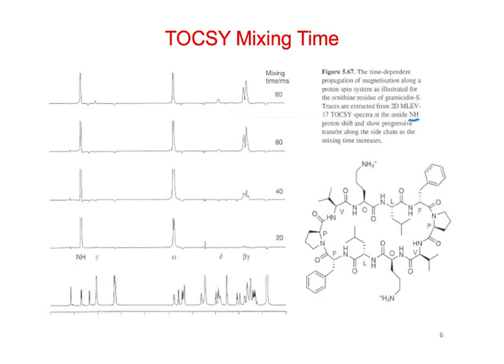Ornithine, maybe. What they're doing here is starting off at the NH instead of just the alpha proton, and changing the mixing time. Like I said, you could run this series of experiments where you increase the length of the mixing time and allow the signal to propagate through more spins.